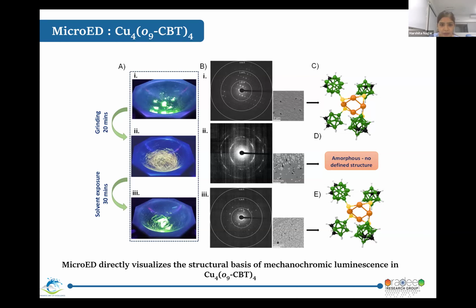In many of the cases we have seen, for some crystals we will not grind them. We will just crush them between glass slides to make them small and then do micro ED. And then after grinding, as you have suggested, we will apply the mechanical force and compare the results before and after.